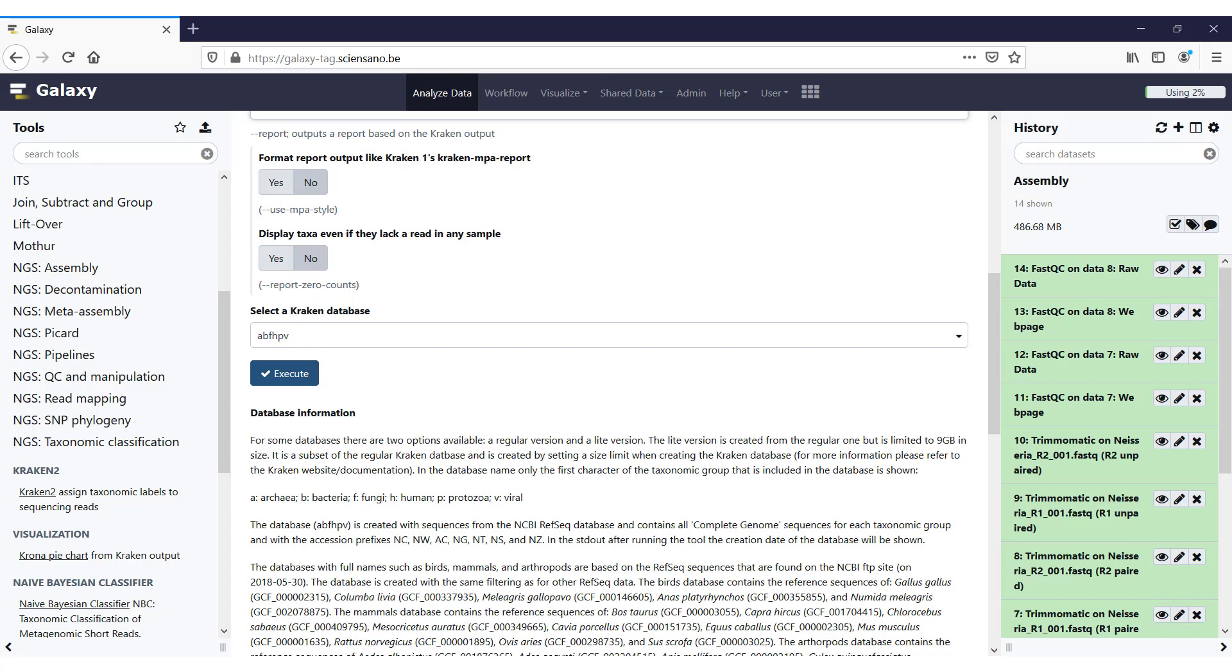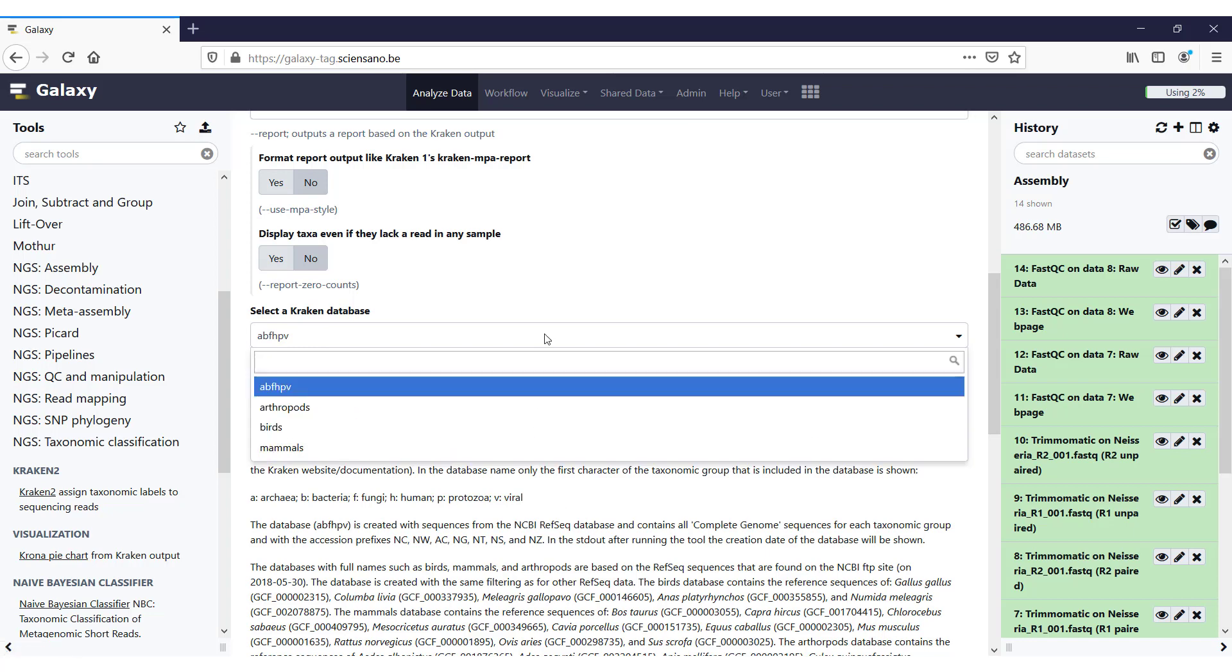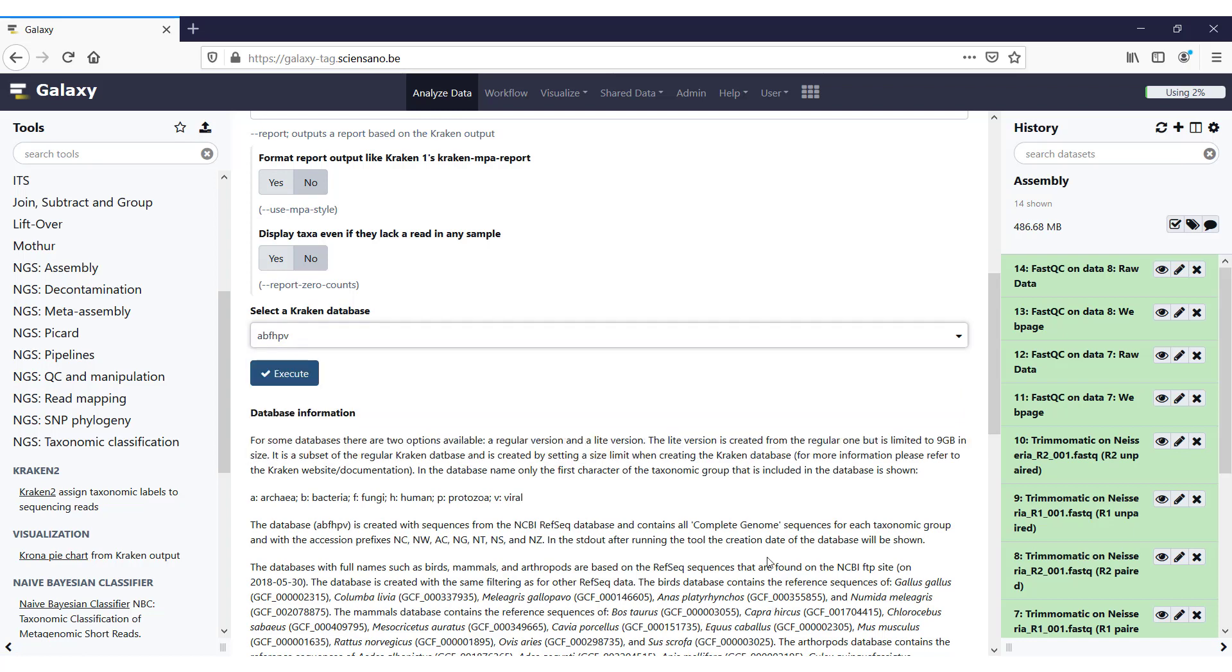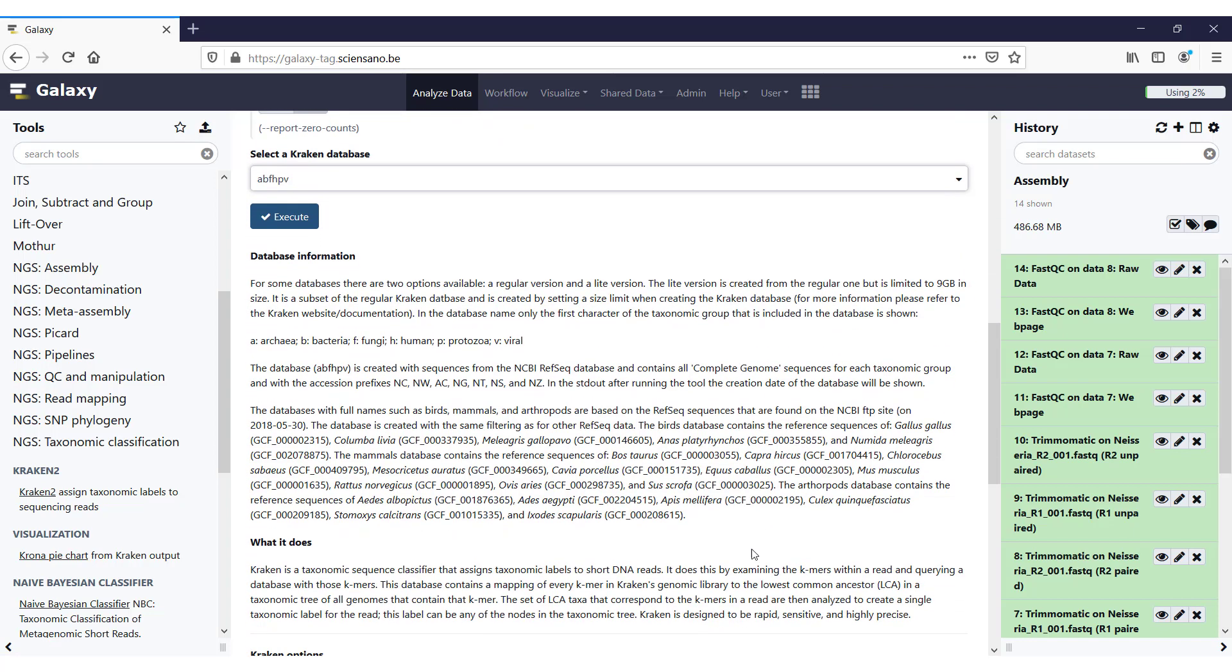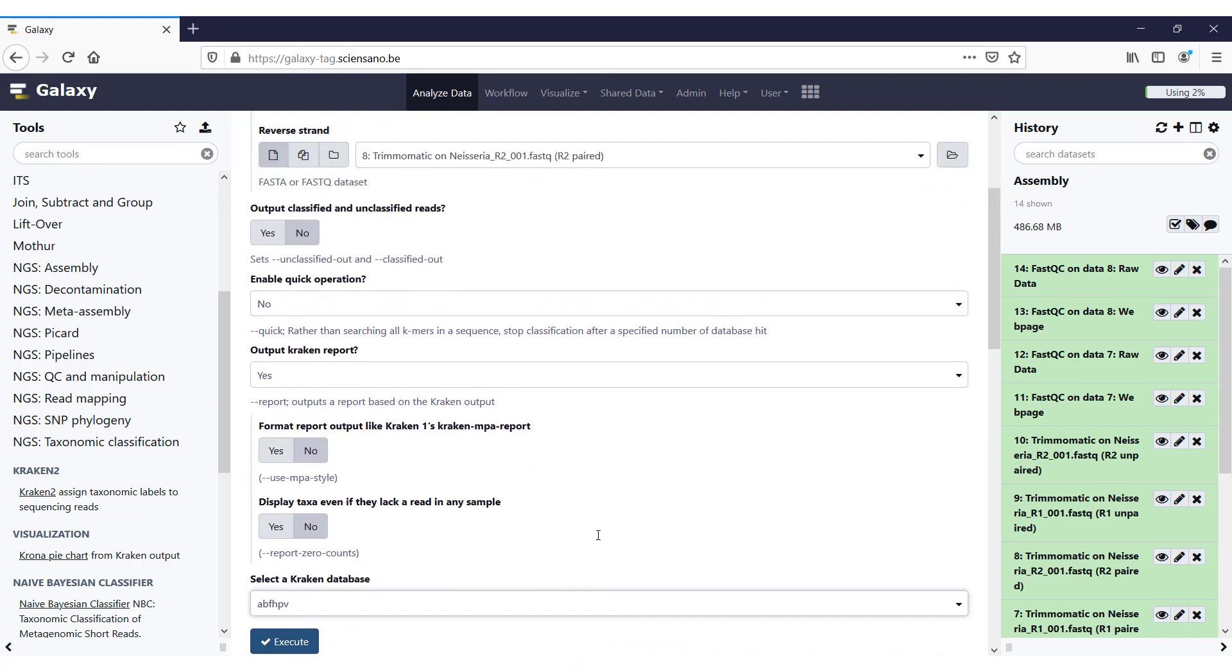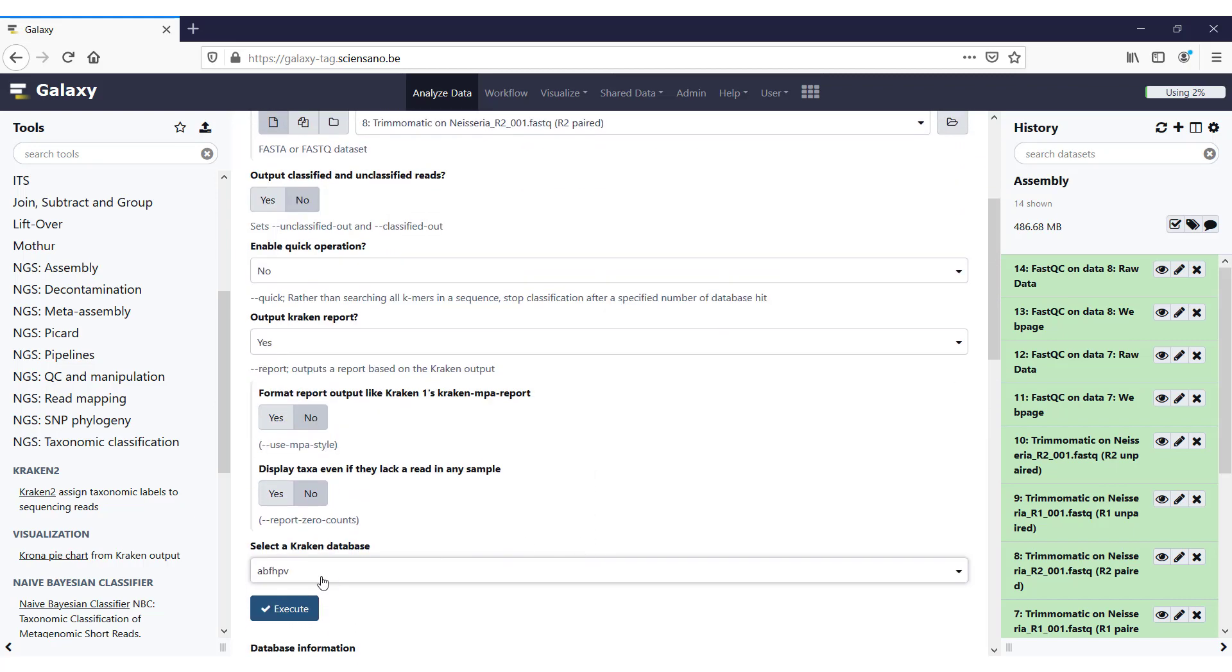So that stands for archaea, bacteria, fungi, human, protozoa, and viral. But you also have arthropods, birds, and mammals. Detailed information about how these databases are created you can find down here. But we're going to use the default one for now, and we're going to click execute.